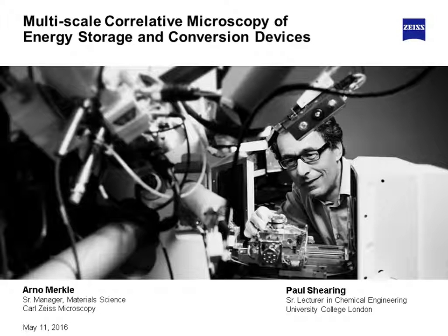And actually, even the focused ion beam is used oftentimes to create pillars. We saw some pillars for compression studies there as well, and you could even potentially use the Atlas V workflow to identify a subsurface region and mill out a pillar or a sample approximately of a pillar shape to then place into the ultra.